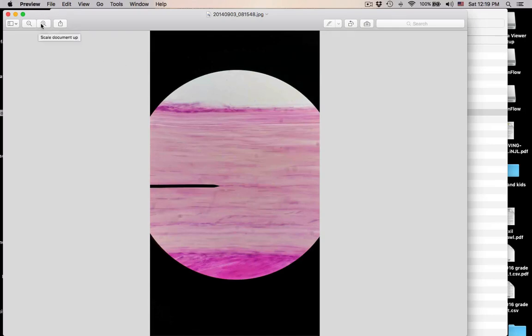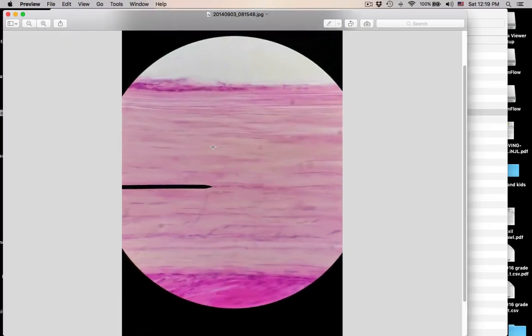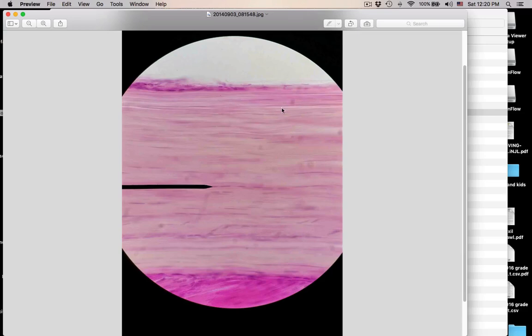This is dense regular connective tissue. You can see the flattened nuclei of the fibroblasts squished in here. The matrix is filled with collagen fibers running parallel to each other in one direction. Dense regular connective tissue is a connective tissue proper, and it is found in tendons and ligaments.